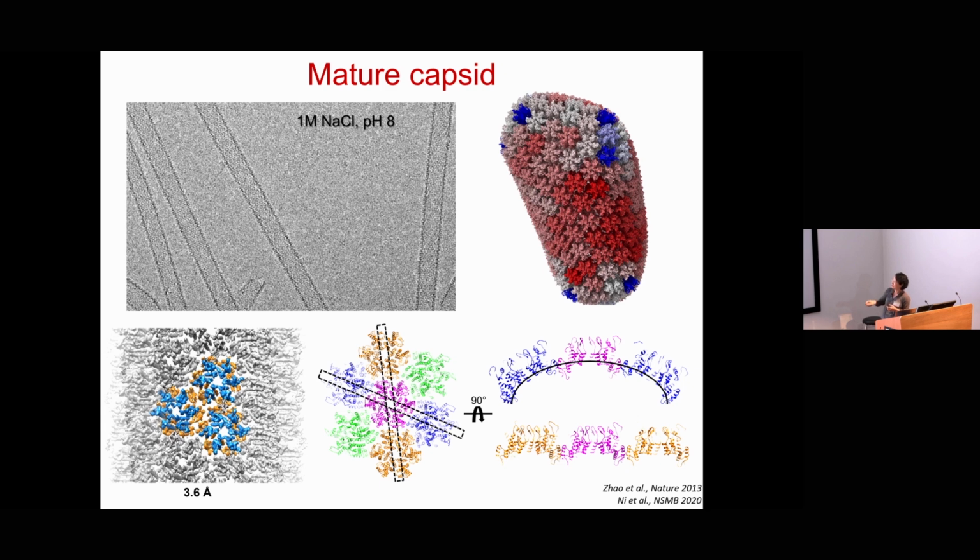Each hexamer in the tube has a different curvature. This is one of the examples here. If you cut a slice along the axis of the tube, you see the hexamer in this direction is flat. And if you cut across the curved direction, you see hexamers all curved. And at each diameter, the assembly is very heterogeneous. The different diameters are reflected in the conical shaped core, and different diameters have a different shape and a different curvature of hexamer. So that's what we found.